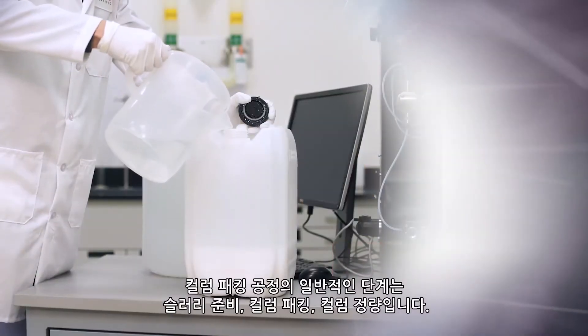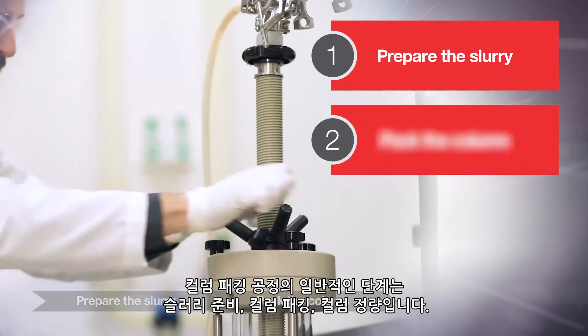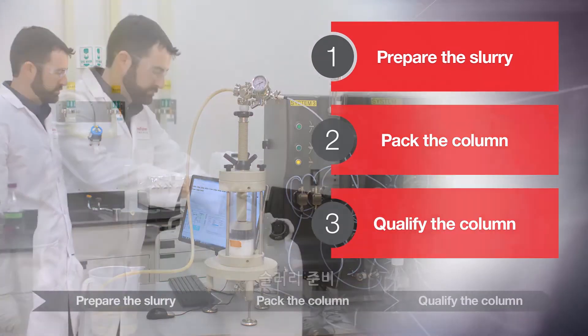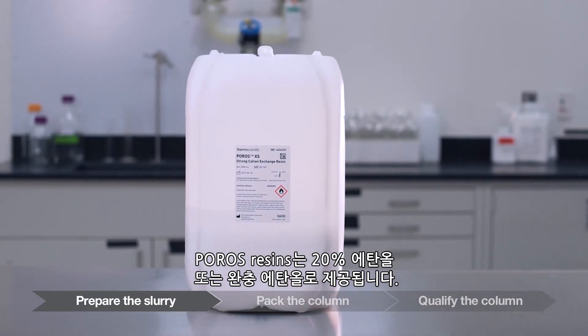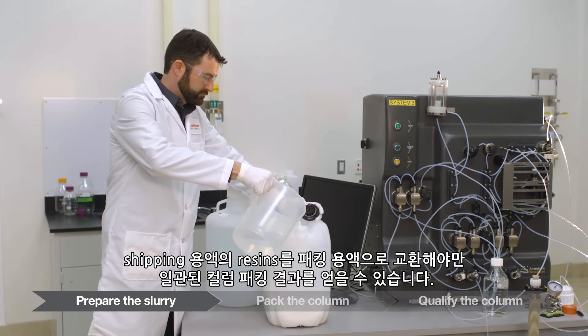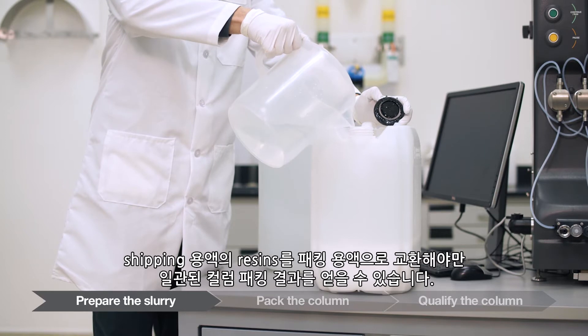The general steps for the column packing process are: prepare the slurry, pack the column, and qualify the column. Poros resins are supplied in 20% ethanol or buffered ethanol. It is important to exchange the resin from the shipping solution into a packing solution in order to achieve consistent column packing results.